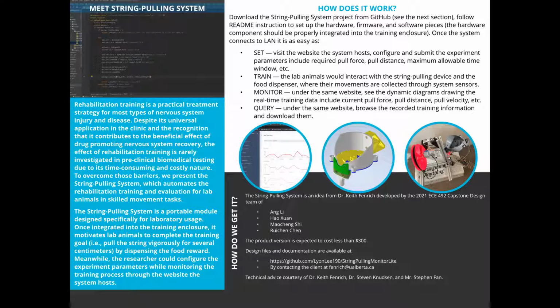The previous approach for the training is usually done by manually tying food rewards to the string ends. However, the original setting requires tedious preparation. We hope the deployment of our system could greatly reduce the time and money cost of such training experiments.